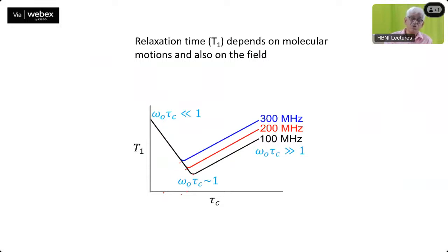What kind of molecule do you have? What is the kind of motion you have in your molecule? See, therefore, dynamics has automatically crept in. Dynamics has come in two ways. First, you can have dynamics at the overall molecular level, or you can also have internal dynamics. In a large protein, apart from the total tumbling, you will also have segmental motions inside the protein. That will contribute additional dynamics. That is why I said dynamics is intrinsic to NMR, and this provides you a whole lot of information with regard to the dynamics in proteins.